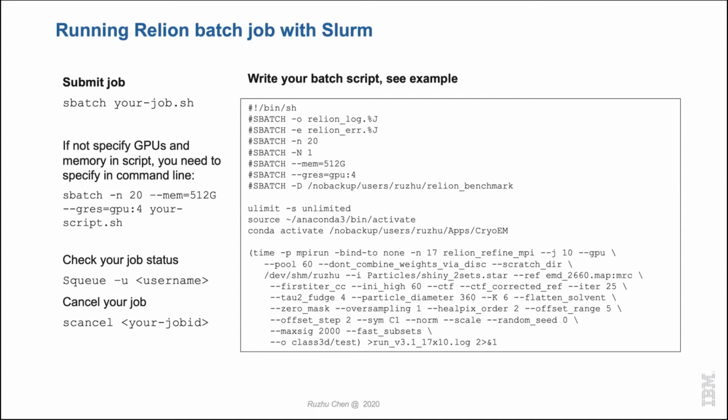And here, I did receive some feedback about the parameters we are setting. Someone recommends some parameters like the fast subset and the maxsig parameter.